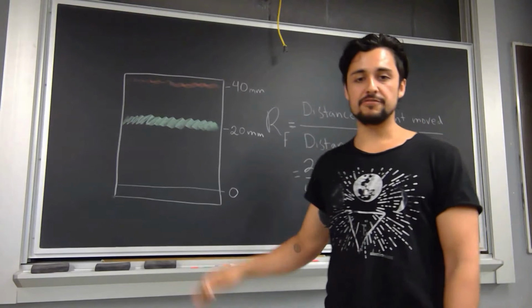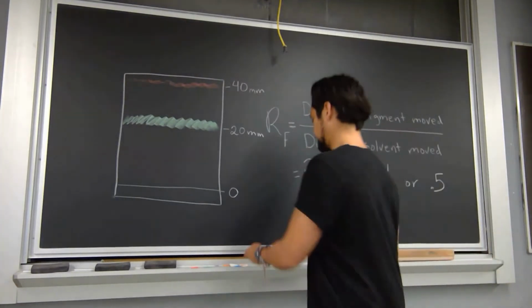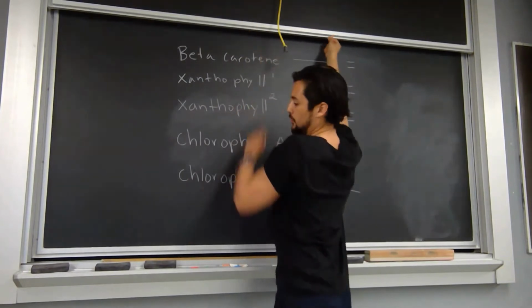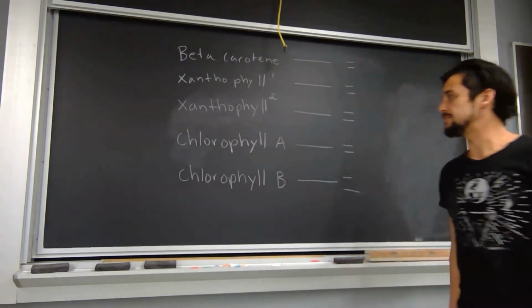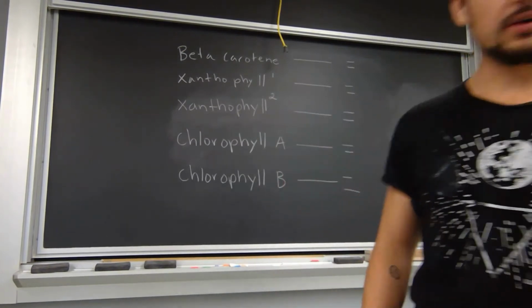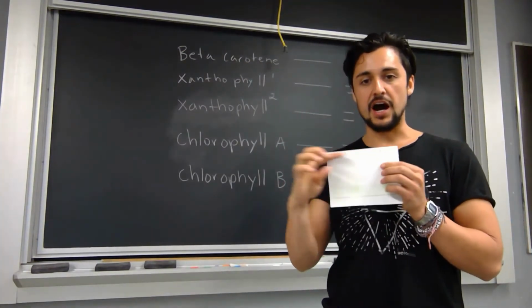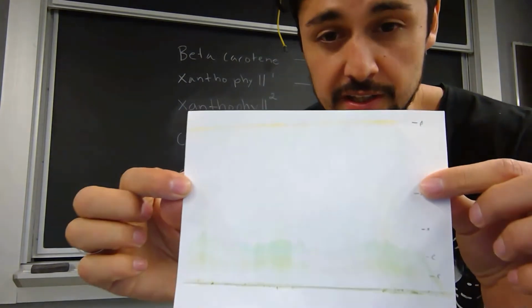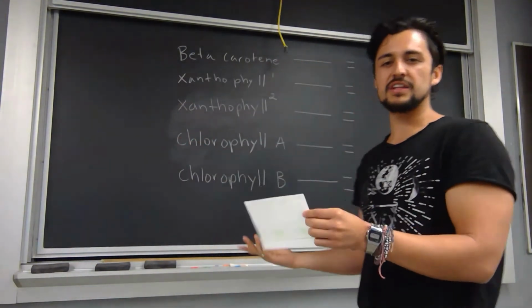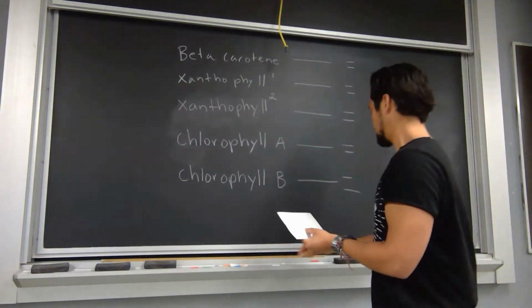So we're going to do that for all of the pigments. And on our chromatography paper, we found 5 measurable pigments. One of those is going to represent the top line. It's basically the line of the solvent. So that's actually going to be a 1-to-1.